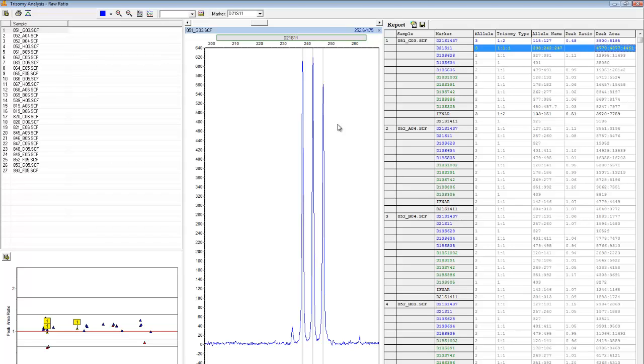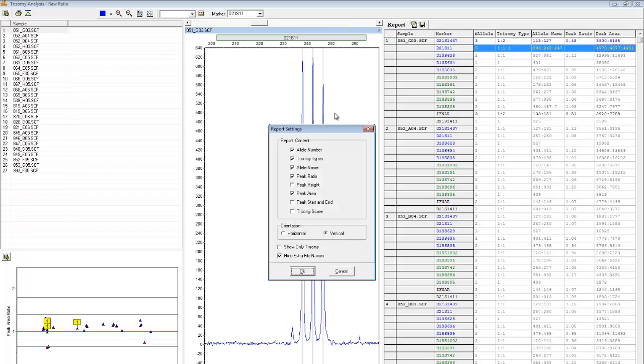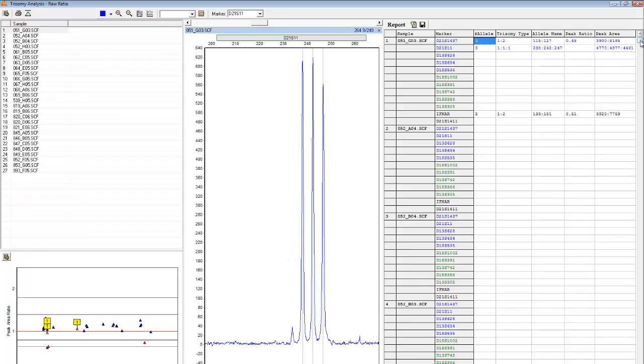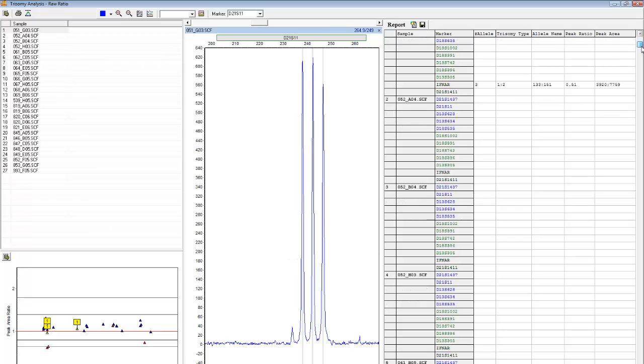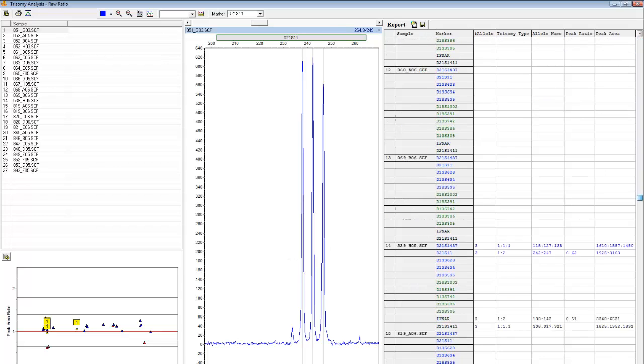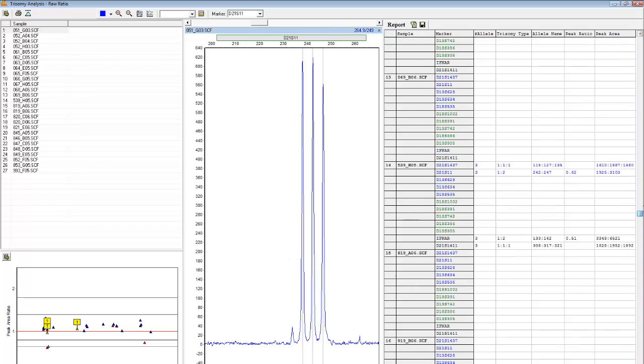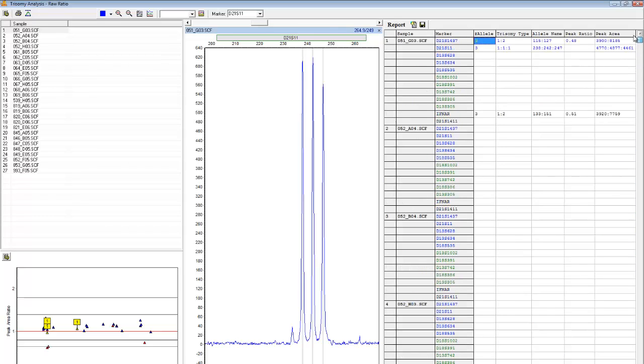The report table can be easily modified by clicking the Report Settings icon. Here there are many customizable settings. For example, I can click Show Only Trisomy, and then click OK. Now, only information for trisomic markers is being displayed. The report table can be saved as an Excel or text file by clicking on the Save Report icon.